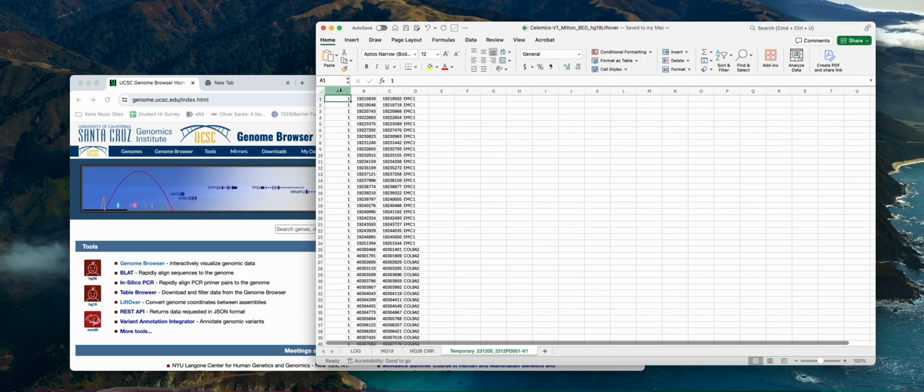But every bed file, no matter what version you have, has 3 minimum column information requirements. In this case, the first column has to have the chromosome number. The second column will have the starting coordinates of the feature, and the third column has to exist to tell you the ending coordinates of the feature. And this is just base number on the chromosome. Optional is a fourth column and some other columns, but you often might have a fourth one there. And the name, for instance, of your gene might be put into there.